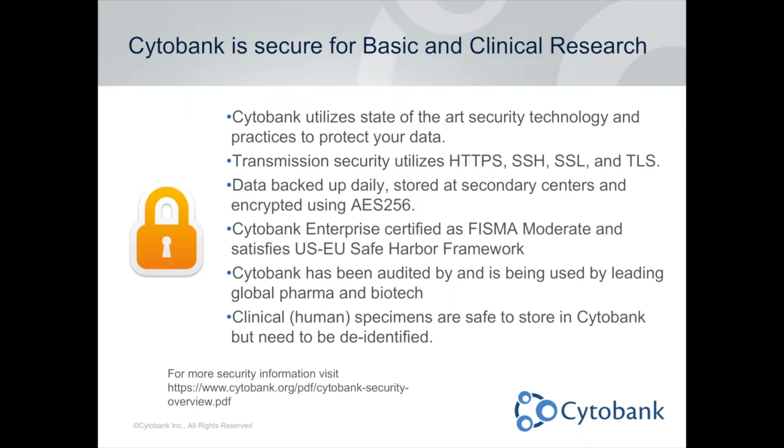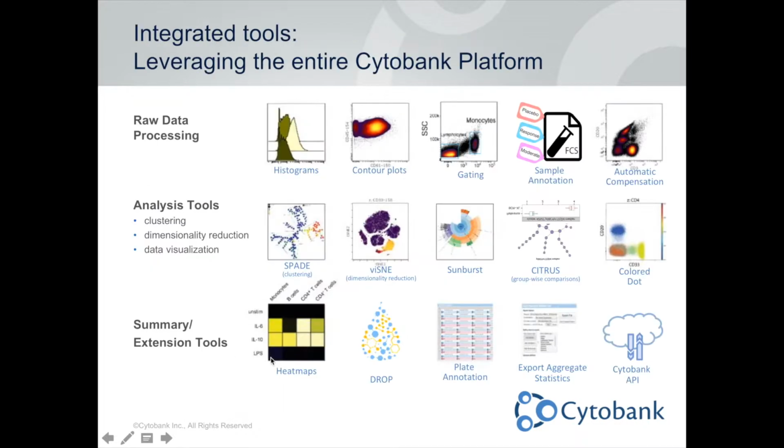One of the first questions I get when I talk about Cytobank is about the safety of storing your data on a cloud-based software. We take data security very seriously and work hard to make sure we have a secure repository for your data. Here are some steps we take, but if you'd like more detail, you can visit our white paper at this address down here.